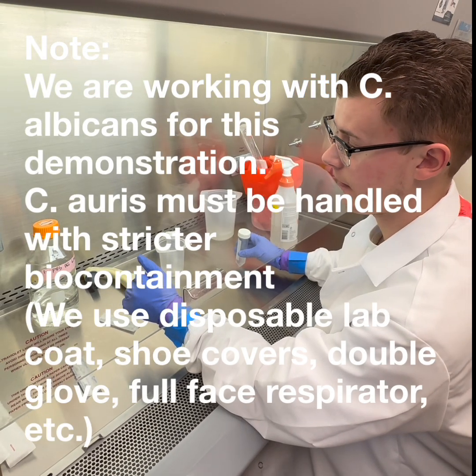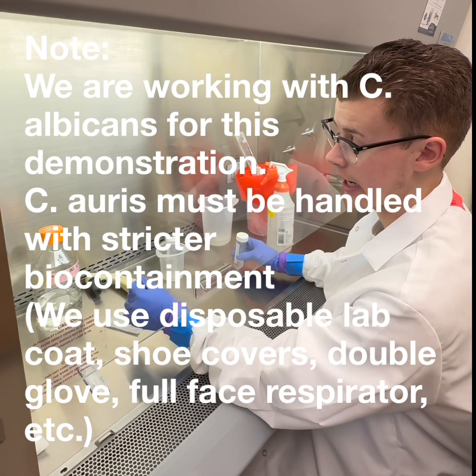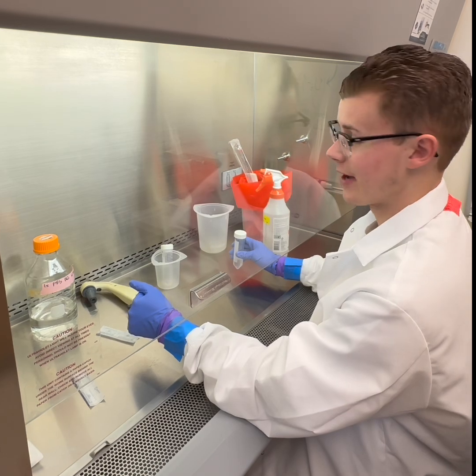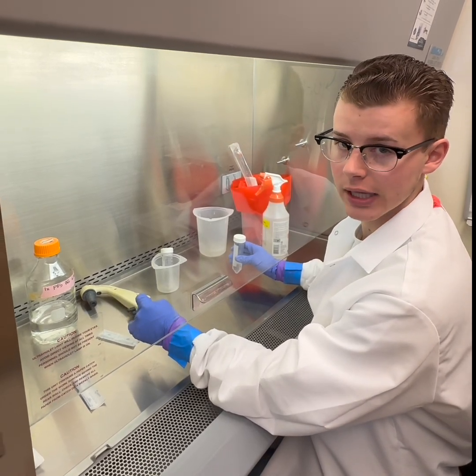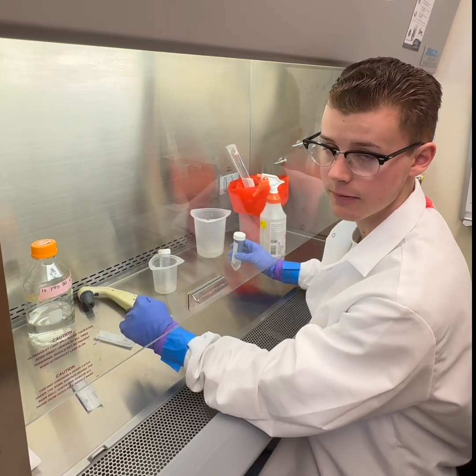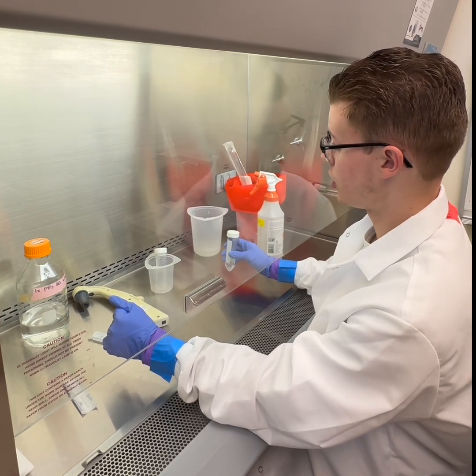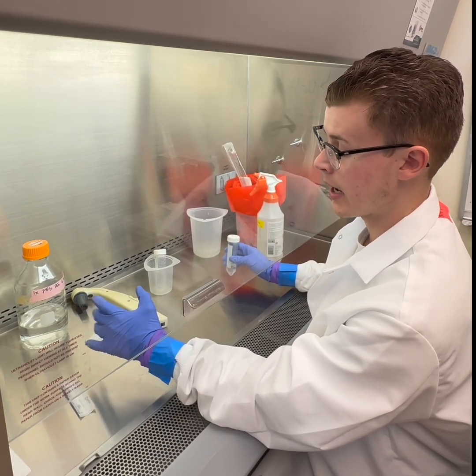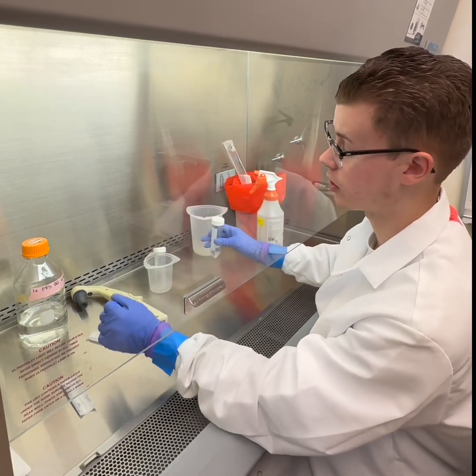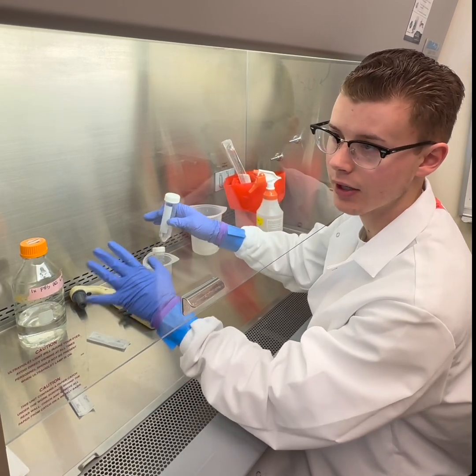Right now we have woken up some cells from -80. This is Candida albicans that we're working with at BSL2 currently. We've got those started on YPD agar plates. We've taken an isolated colony and inoculated a YPD broth culture with that overnight. And then this morning, all that we are doing is washing the pellet. So we're spinning down our broth culture and trying to get all of the YPD out so that it's just a clean pellet of just cells.